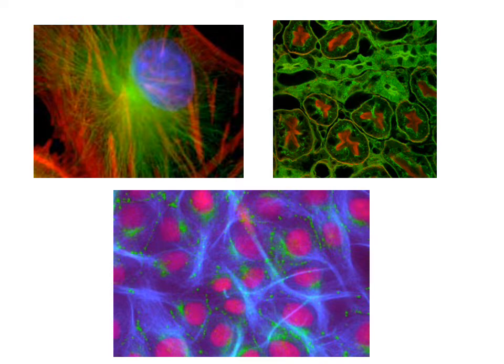Here are some more examples of the fluorescent microscopy. It makes it really bright. You've probably heard of fluorescent dyes. Same thing, fluorescent stains. It makes them very bright and very colorful.